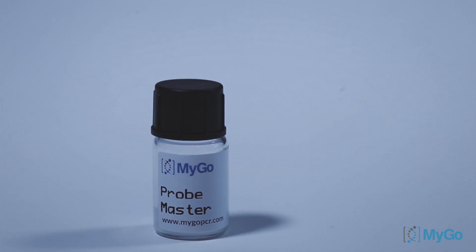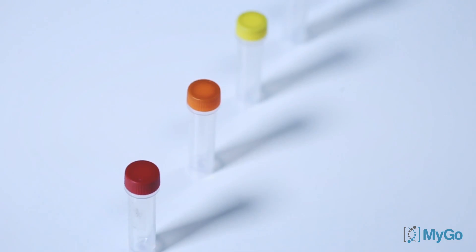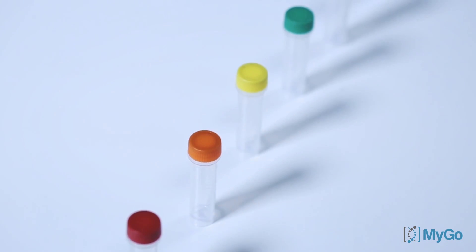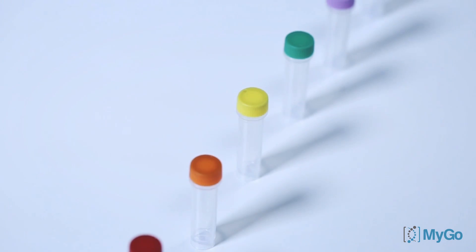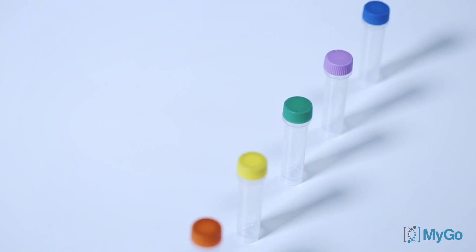The kit contains one vial of MYGO Probe's master, which is a lyophilized master mix and a buffer that's used for resuspension. The kit also contains six DNA tubes with caps colored red, orange, yellow, green, violet and blue.